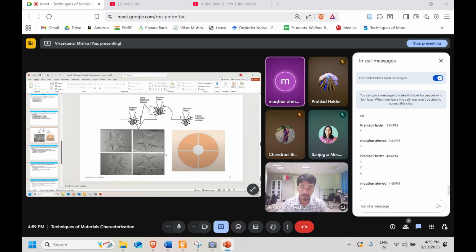But here, why are we interested in the shadow effect? So the shadow is giving us something wrong in direction, right? It's nothing like a wrong direction. It's just that the present detector is not able to detect this because the direction is deviating to a different section. It's like a cavity or something is there which is deflecting. Let's say the grain boundary itself can be sufficient to deflect the beam somewhere. In that case, this scattering, which leads to the change in direction, will contribute toward the contrast.